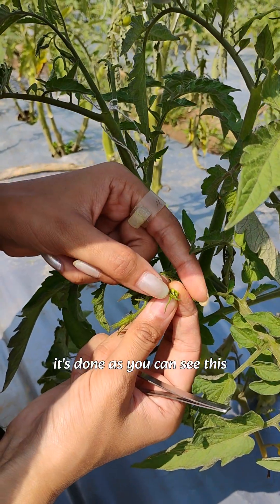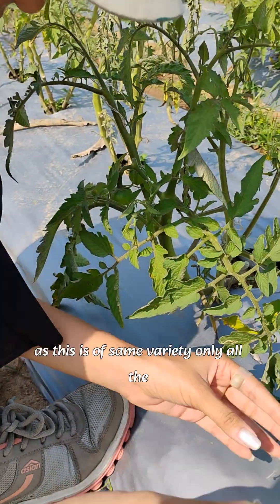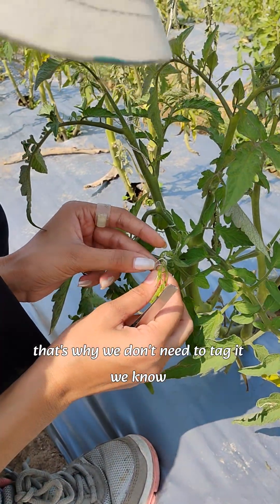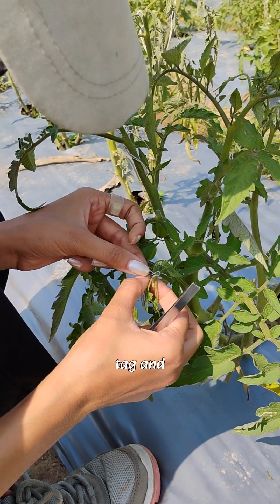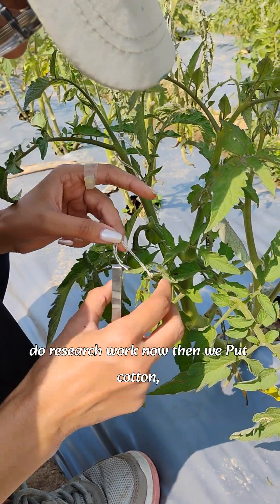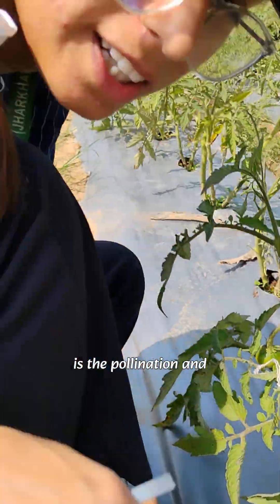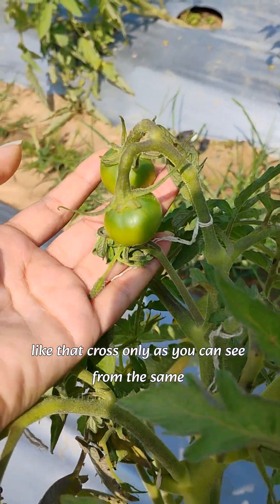It's done — as you can see, this powder is on it. Now, since this is of the same variety and all the flowers are on the same plants, we don't need to tag it. If we do research work, we would put cotton, but here they are not putting it so we will also not put it. This is the pollination and emasculation of tomato — this is a cross.